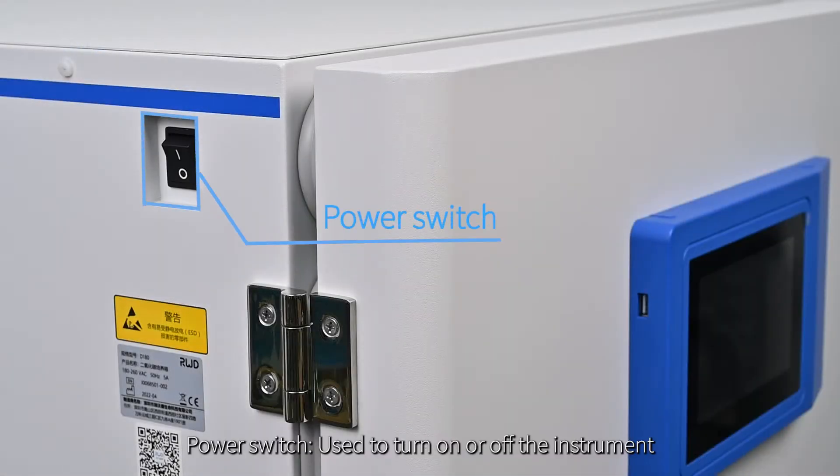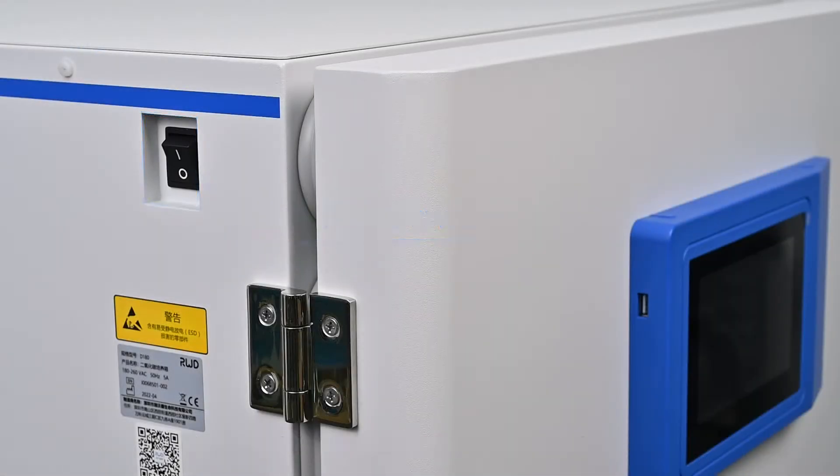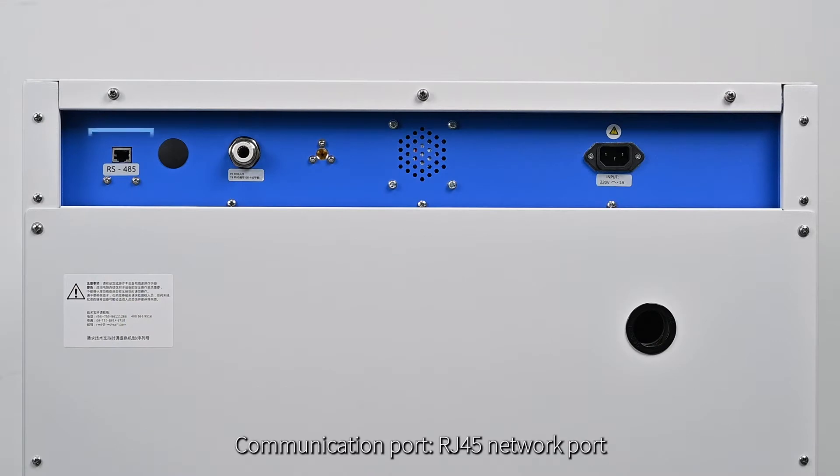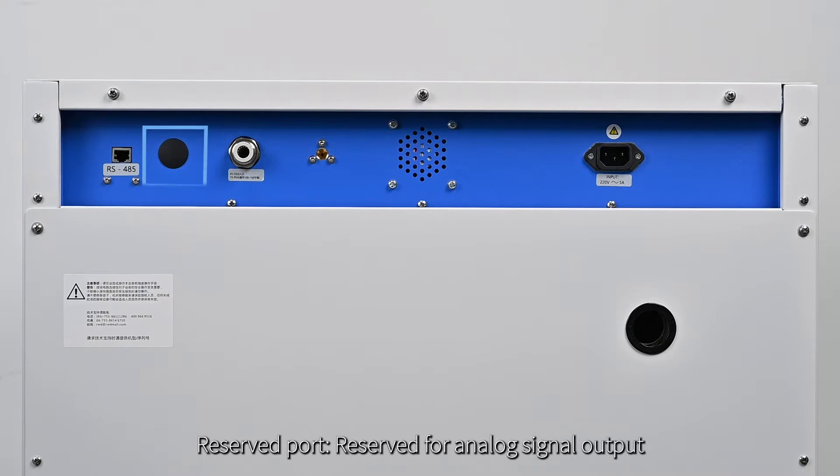Power switch: used to turn on or off the instrument. USB port: used to export data and upgrade software. Communication port: a RJ45 network port. Reserved port: reserved for analog signal output.